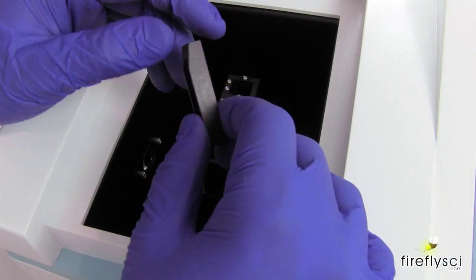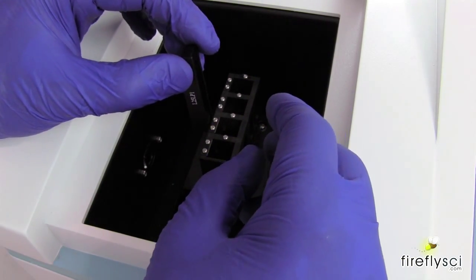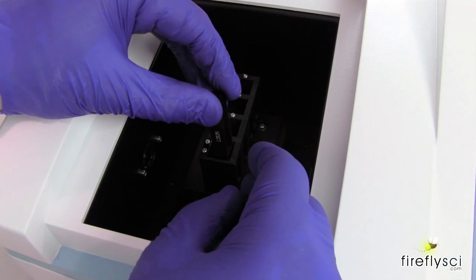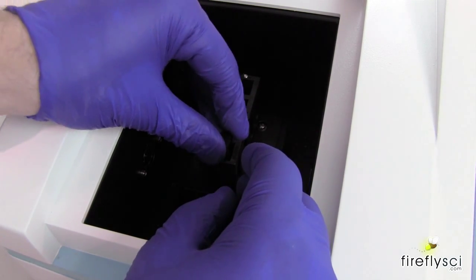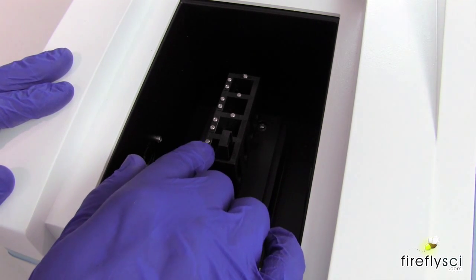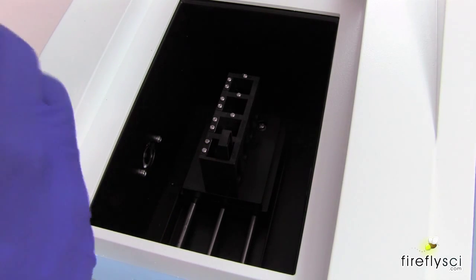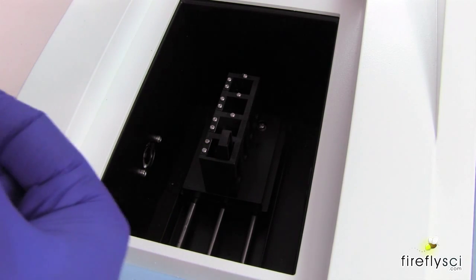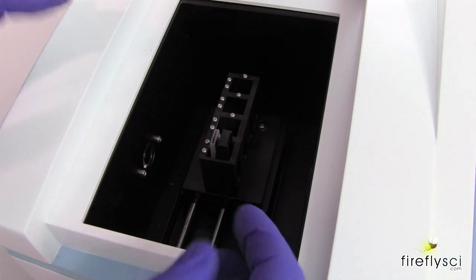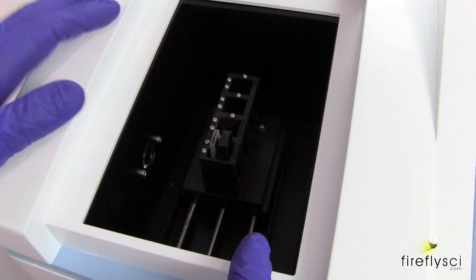Okay, so here we go. So we have our L25 spacer, and we're all set to go. We just have to make sure that we put it in the spectrophotometer correctly, which means the two open windows go in the direction of the optical beam. So we just slide that right down to the cuvette holder right there, and there's just enough room for that one millimeter cuvette to go right here next to it. So we'll take a Type 1 UV one millimeter, and we'll go ahead and slide that right in, and you can see how perfectly that fits in there, and it stands up nice and straight, this way your measurement is 100% accurate.